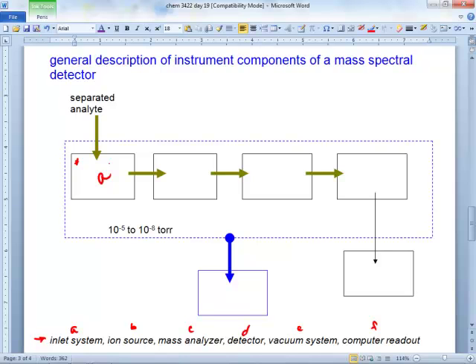Somehow it's allowing something to go from atmospheric pressure to an extremely low pressure. And that boundary is secure, it's stable, it's at equilibrium, it's not causing any problems. How it does it, anyway, that's our inlet system. And you get a lot of leaks there, and that's the problem. I have to keep that up.